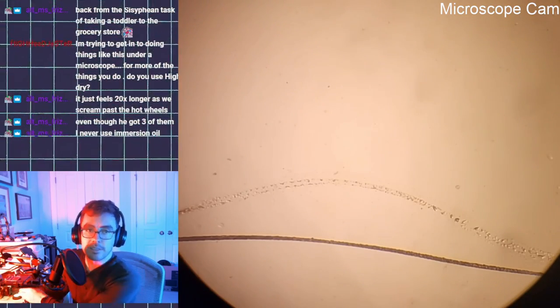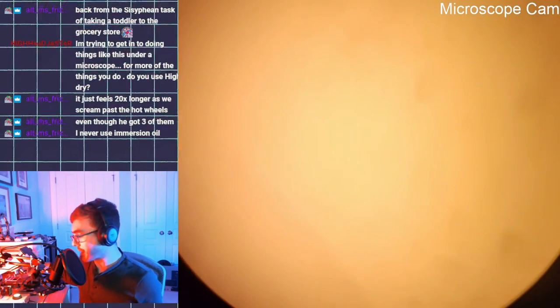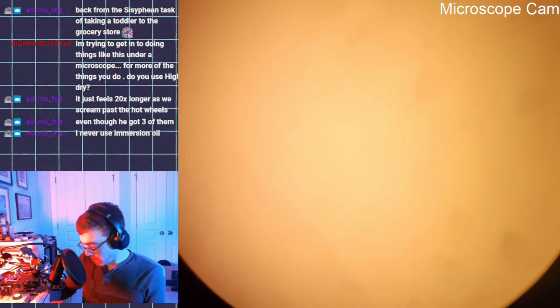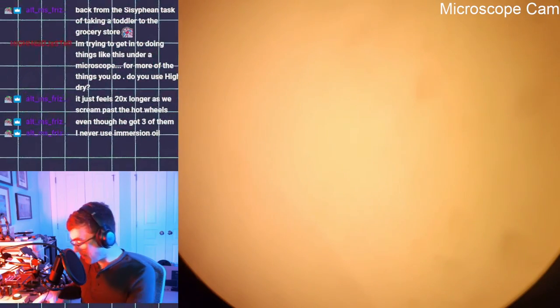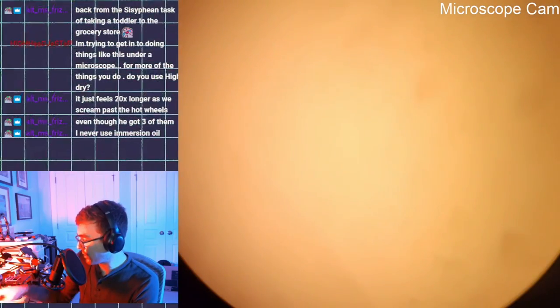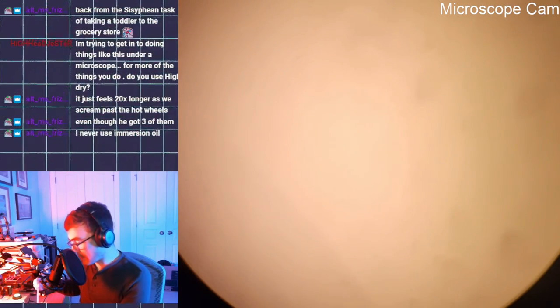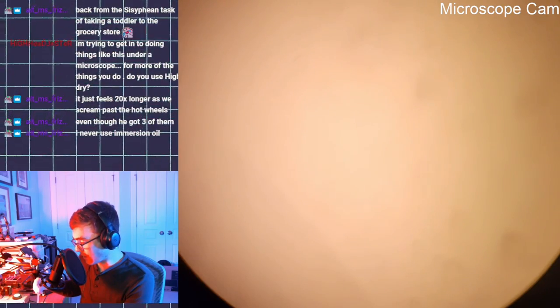All right, well, these stupid things don't want to work for me, so I'm going back to just the larger sample. And actually, I think I might try to grab some of those copepods. I can see them swimming around in the lake sample. Well, that's not the lake sample. So I just have to catch them, basically. Whoops, as I almost spill the entire thing over my desk. That would have been very fun.